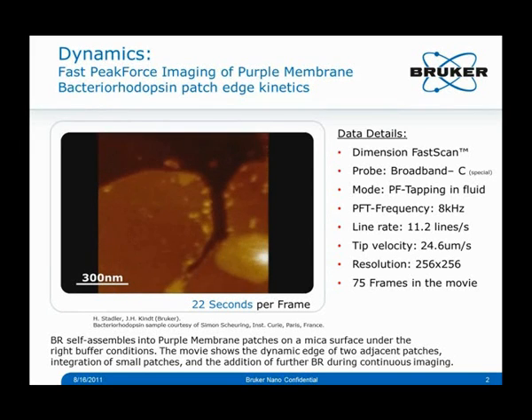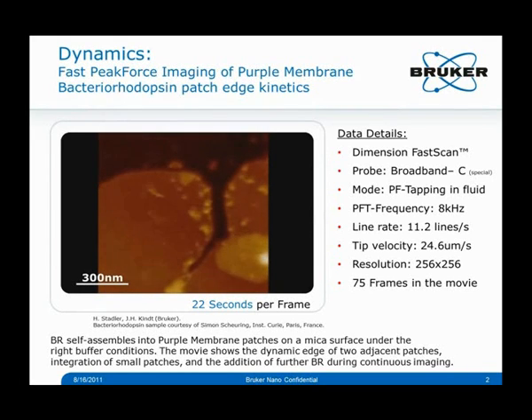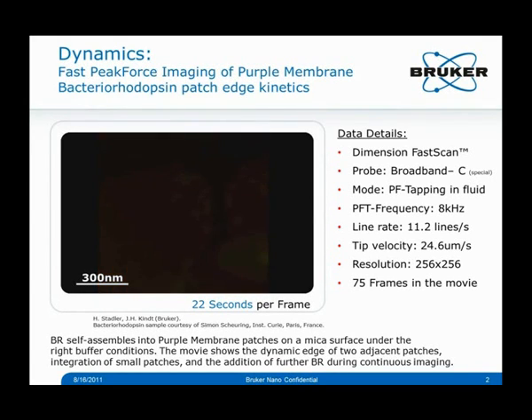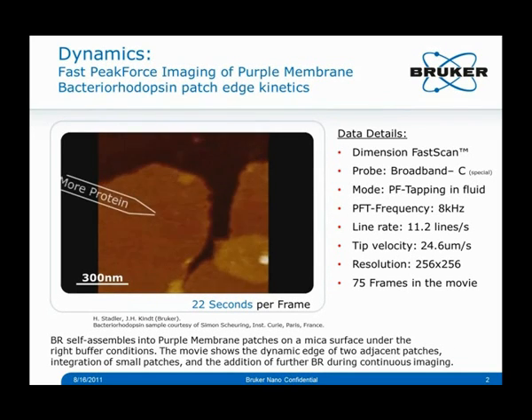The same thing is happening at the top edge the second time a circle appears. So this time there is a separate patch, and now it's being integrated. The other thing we are seeing is that the edge of those two patches is not static; it's always in motion. So it's almost like the surface of water. It's always moving around a little bit.